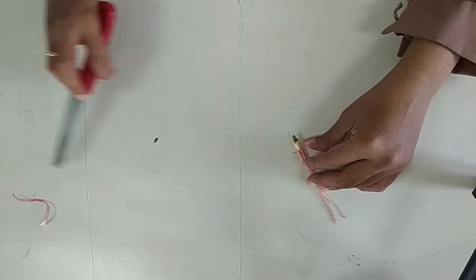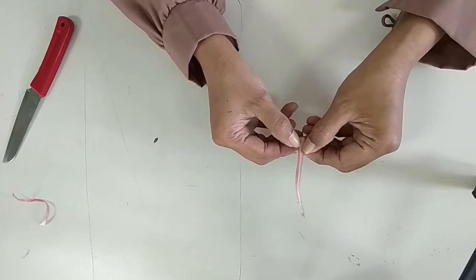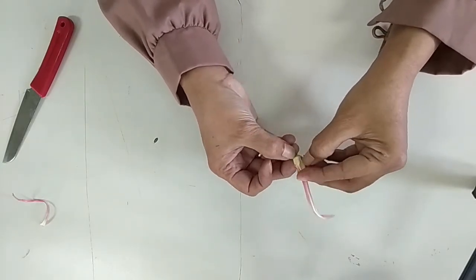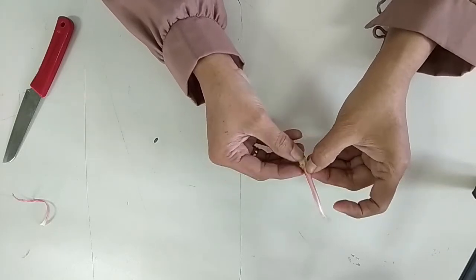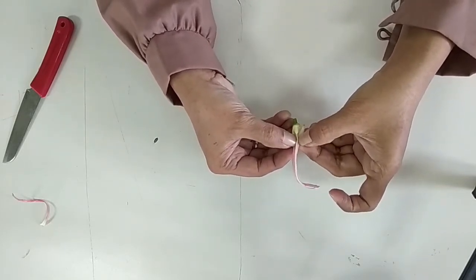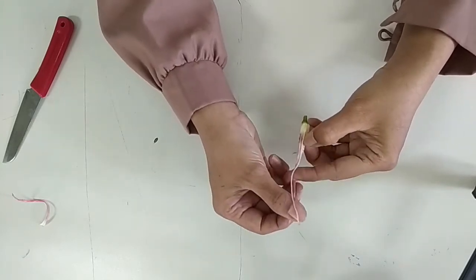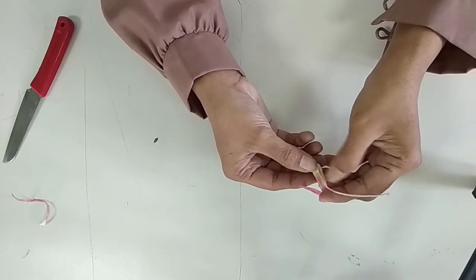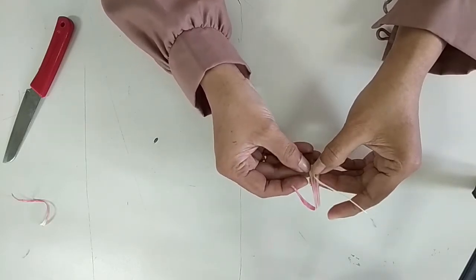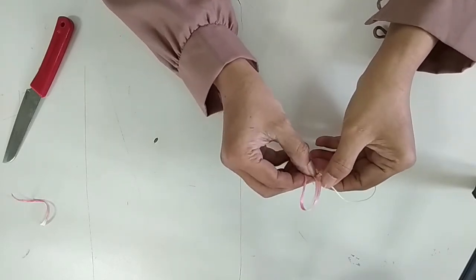Next, expose the ovary with your fingernails. The ovaries are inside the pistil. You can expose them by peeling off the style of the flower from around the ovary. You should be left with a small, white, cone-shaped piece. This is where the ovules are produced.